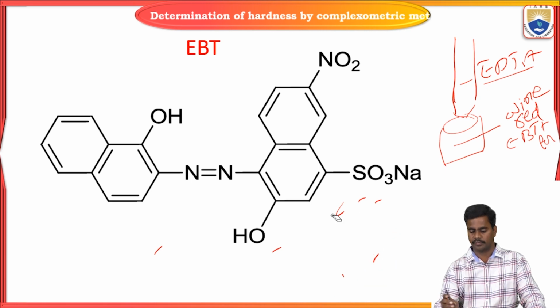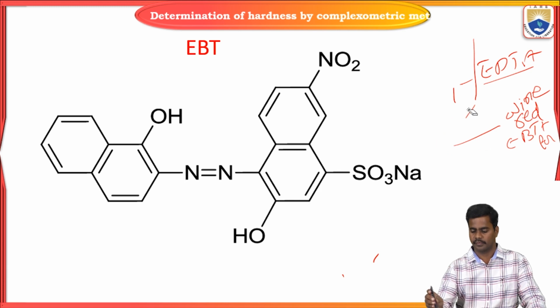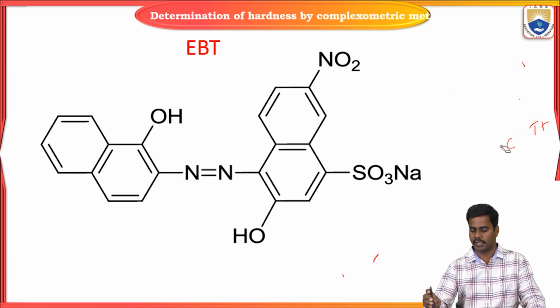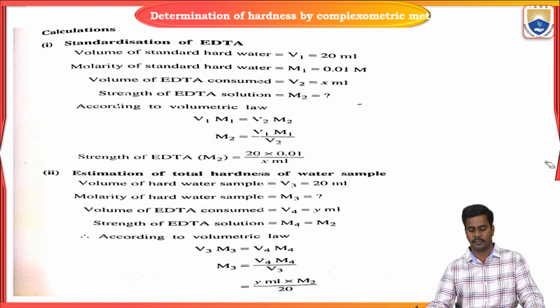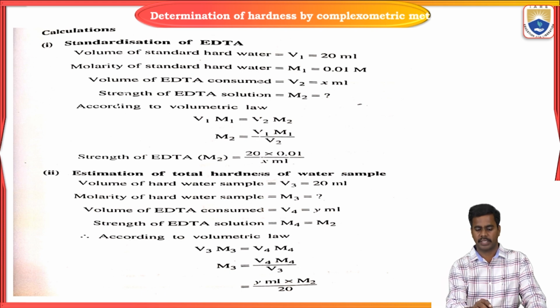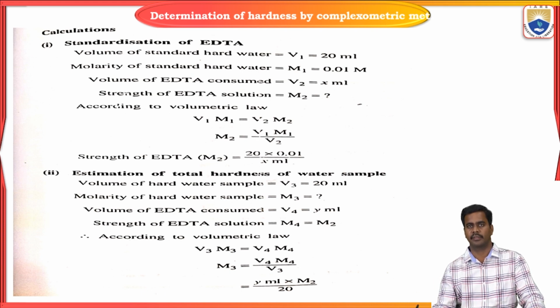By using these values, we can estimate how much hardness is present in the water. That is the first step, the standardization of EDTA.